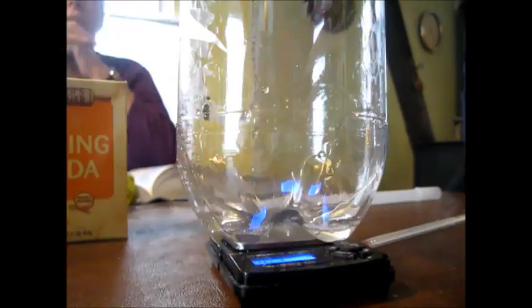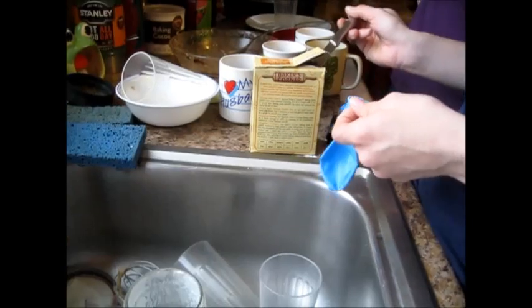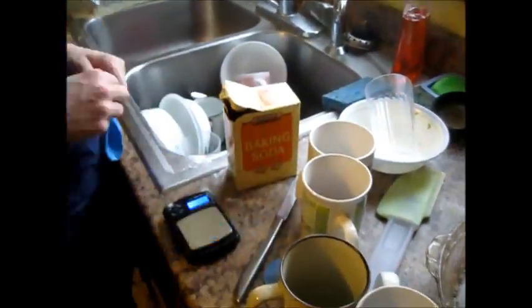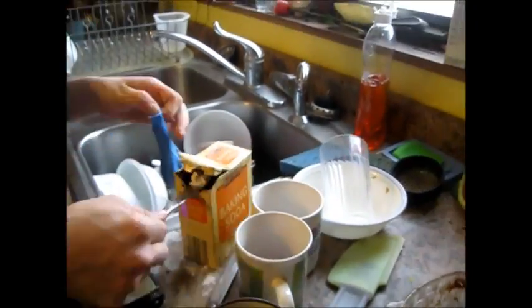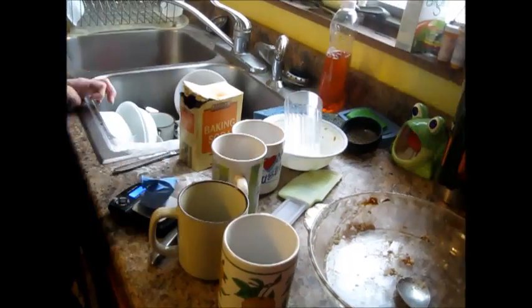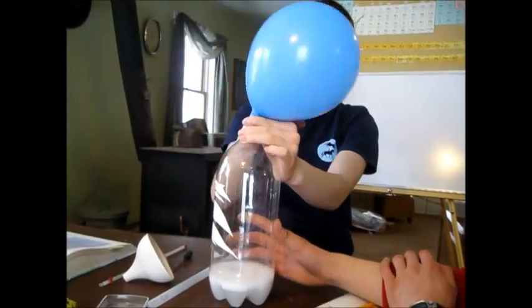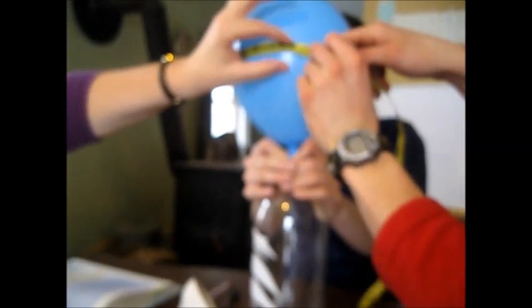We started this experiment by simply putting 200.0 grams of vinegar in a bottle. We went on to the second part of this experiment with putting 30.0 grams of baking soda inside a balloon. We continued by attaching the balloon to the bottle, then we shook all the contents of the balloon into the bottle, and then swirled it slowly to mix in any contents. With that complete, we measured them.